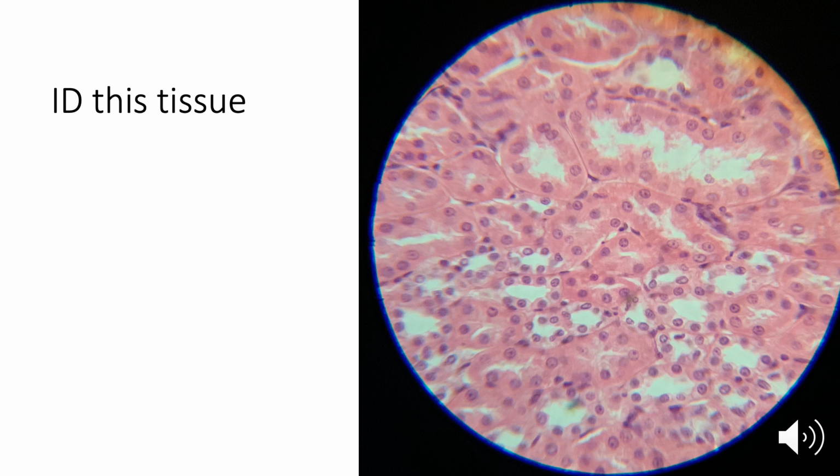Next tissue type. So what I see here are all of these sort of circles. I see a circle there, a circle here, here, and here, with all of these lumens, these empty pockets in the middle. That's going to be my apical surface here. So my empty space with my apical surface. I see nuclei aligned in a single row. So apical surface, a single row of nuclei, and then a basement membrane here on the other side. Here's another example. Lumen, my apical surface, a single row of nuclei, and then that basement membrane.